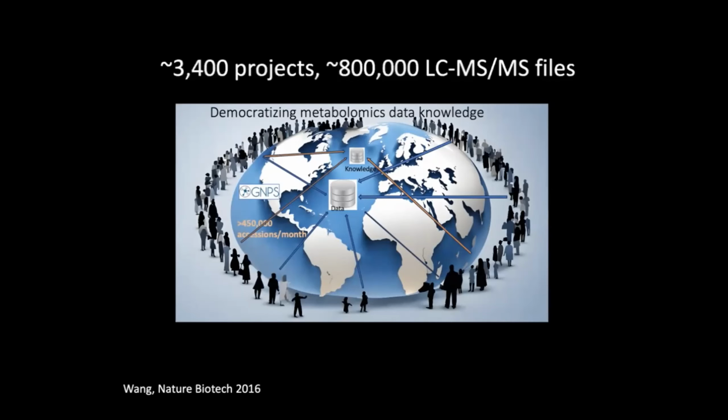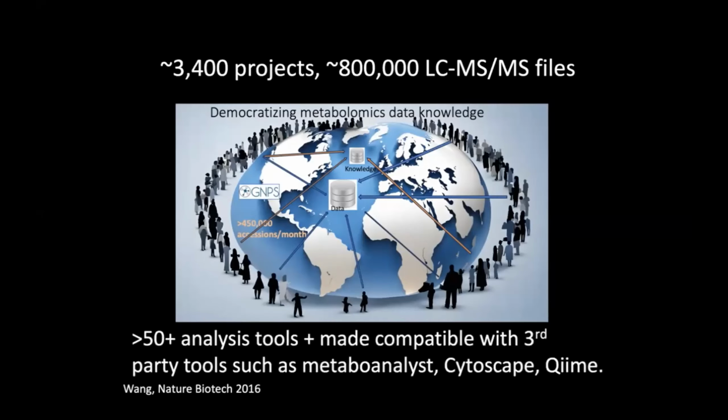And so this has now grown to 3,400 projects and about 800,000 LC-MS files. And if you think about it, let's say the average cost of an LC-MS run, just to run itself, not the cost to get the samples themselves, is already $80 a sample. So you can see the enormous resource that this is creating and the costs associated with getting this data.